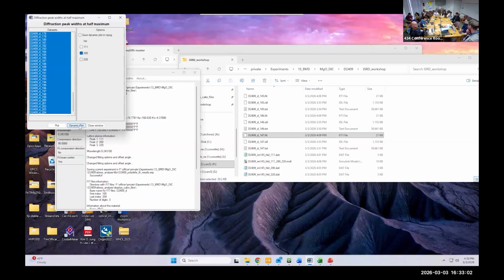Okay, I think that's about it for the angular dispersive diffraction analysis. Did everyone feel reasonably comfortable that they could probably do that? I know you don't remember every step and everything. Inman sent me a manual, I didn't read it. I realized that I knew how to do it after I sent you the email, but thank you for doing that. Welcome. So I need to actually update the manual, make it work. Send a copy to us too. I can send that.